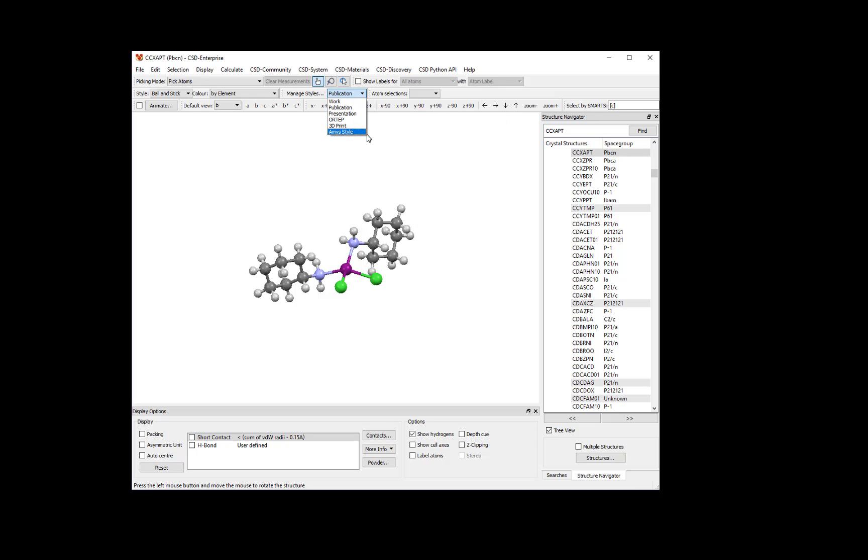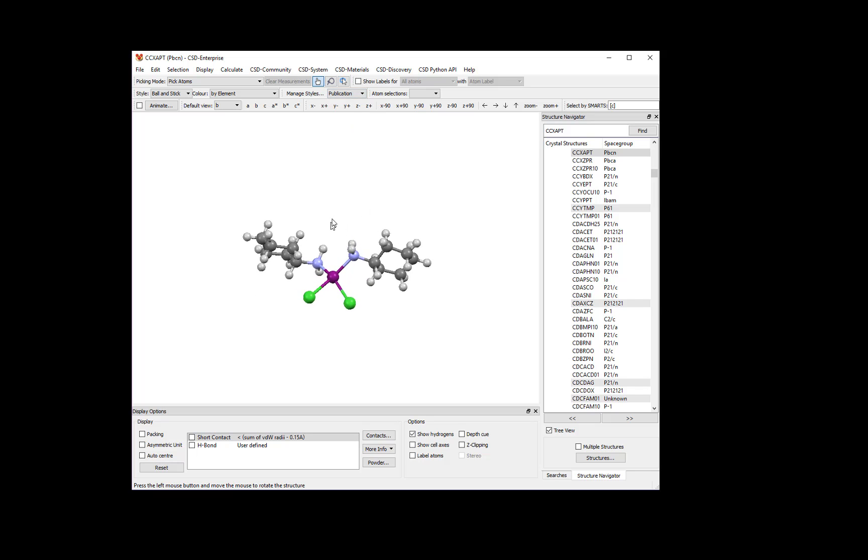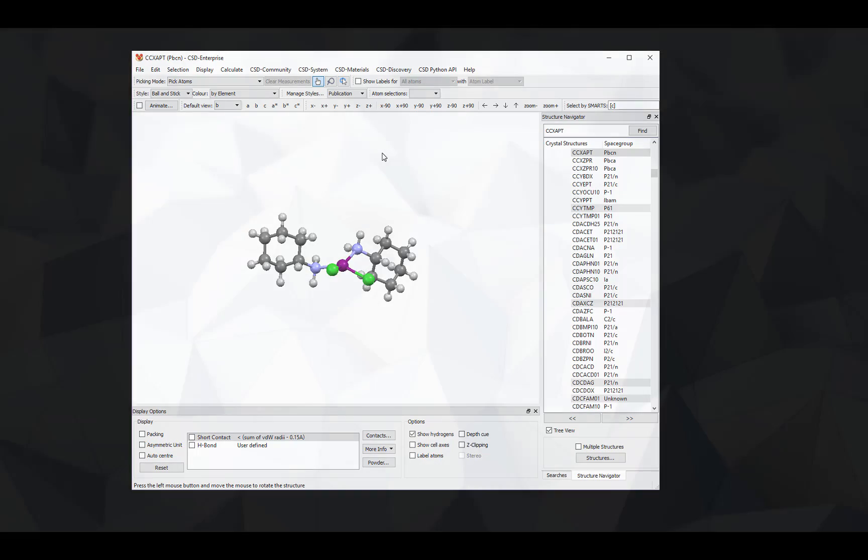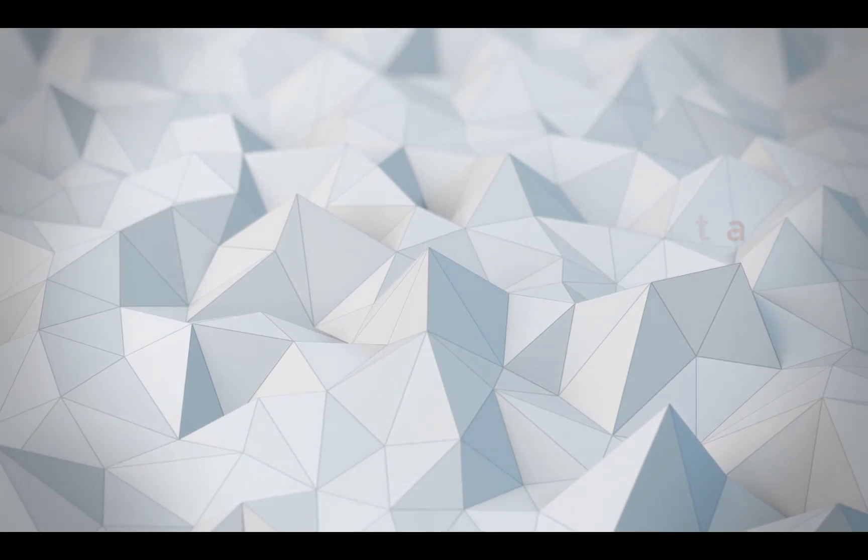See? Here it is. Now you know how to use Mercury to generate simple molecular views and to save your style preferences. Happy visualizing!